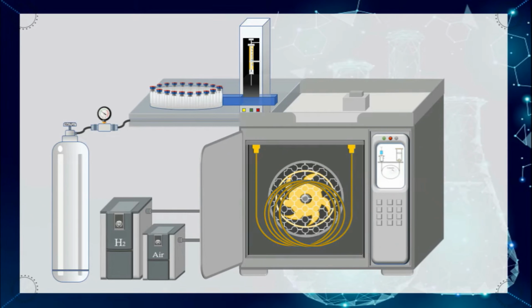Now after applying the sample, it will come through the column. As we have discussed earlier, it can be of two types like packed and capillary column. So let's see our analytes, our samples. For example, our sample contains three types of component: blue, green, and yellow. If we see, the green has lesser interaction with the stationary phase, thus it elutes fast, followed by the blue, and lastly the yellow colored. So this is the basic principle of separation by column chromatography.